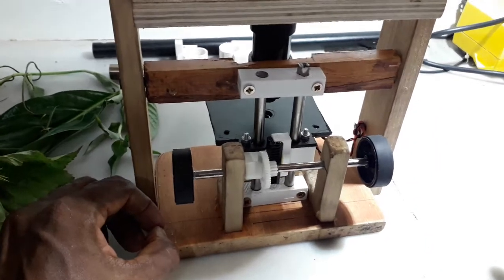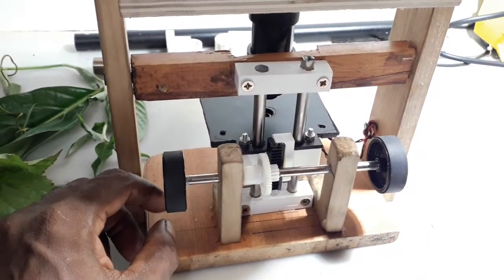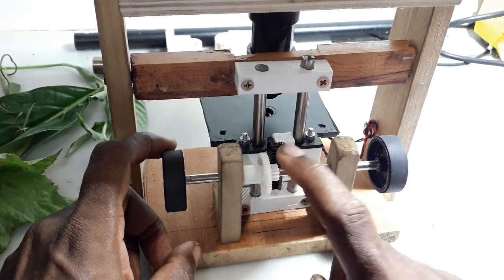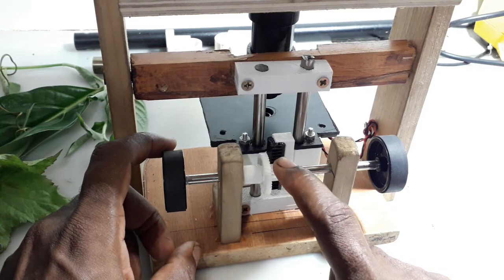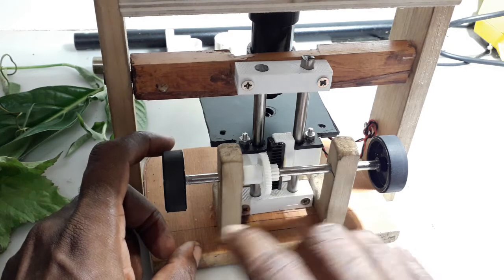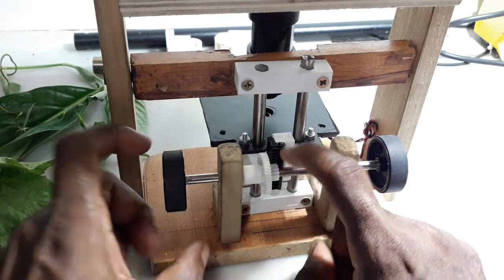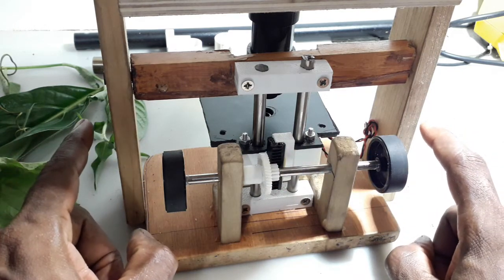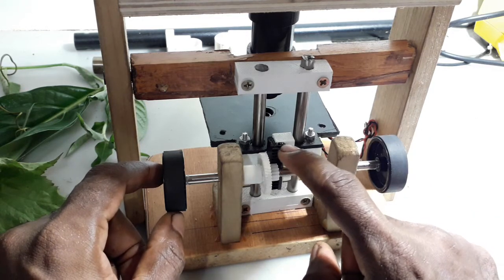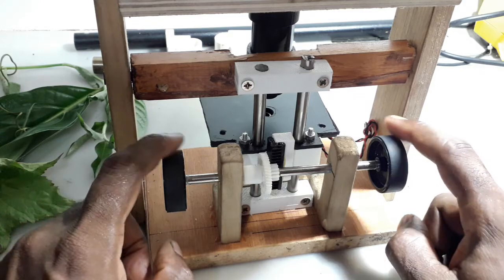However, the gears I got from a scanner. You get a photo printer, a laser printer or something, a jet printer, anything with a scanner on it. What drives the light back and forth has this gear and a long strip of linear toothed flat gear. So I just chopped a piece from there. I'll give you a close-up in a while. And I kept the gear. I also got this stuff from the printer itself.